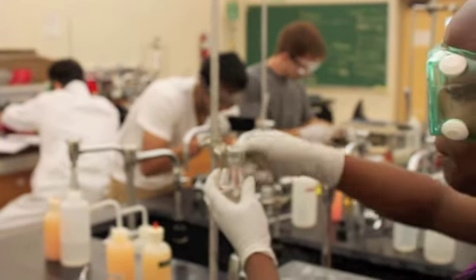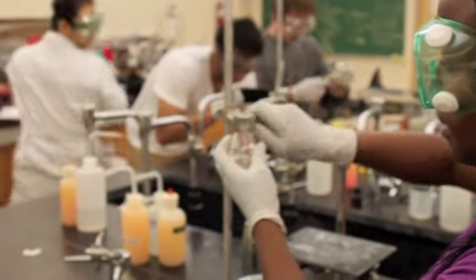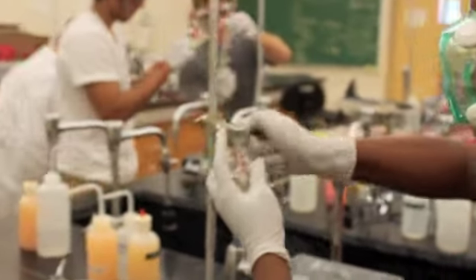Use a 2-finger clamp and clamp it tightly. Otherwise, your glassware looks like this. And once you clamp it, ensure it's clamped tightly. The white parts are what you will get.